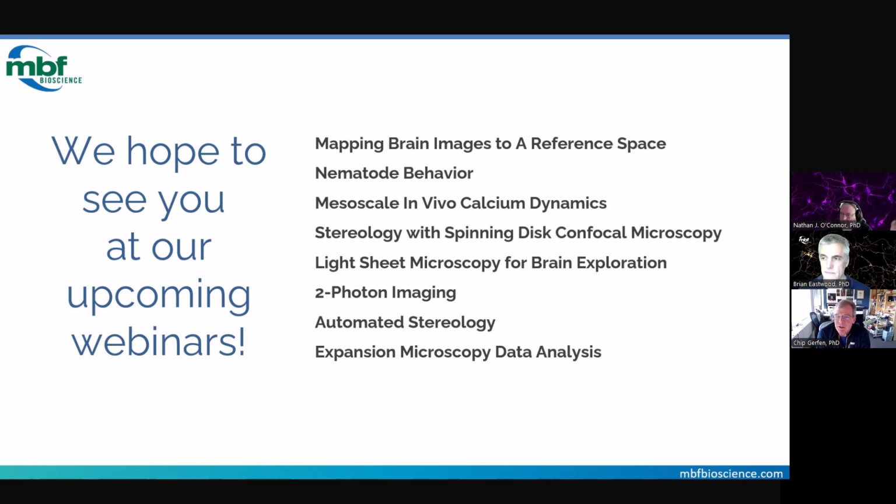So from start to finish for a single brain, it takes 2 to 3 days, and the amount of labor the way we've got it worked out is pretty minimal. One thing I will say is that because we do free floating immunohistochemical sectioning, we can go up to 4 to 5 fluorophores, different markers, in individual sections. So that's about the amount of time it takes.